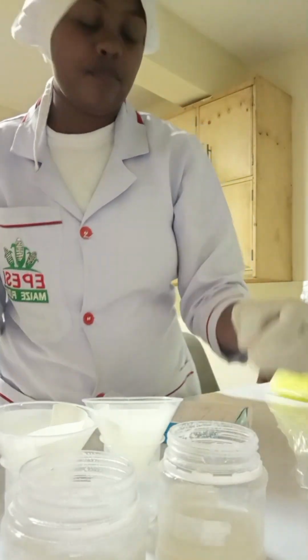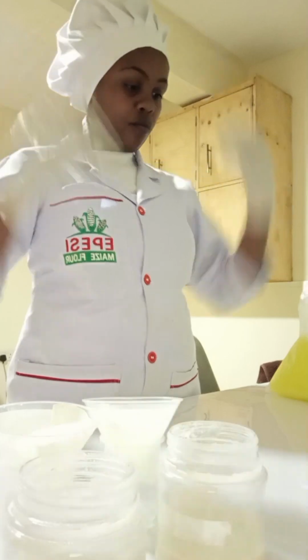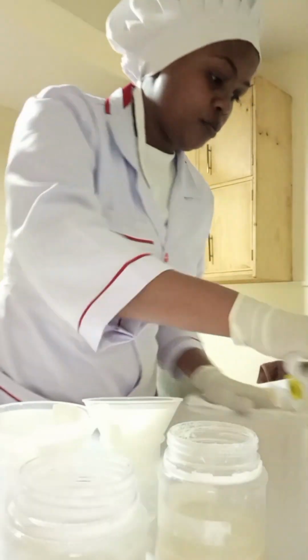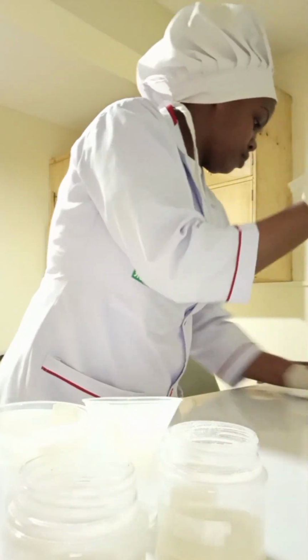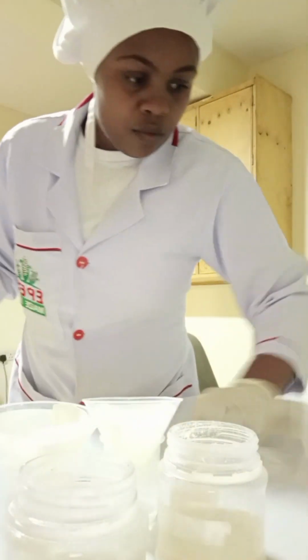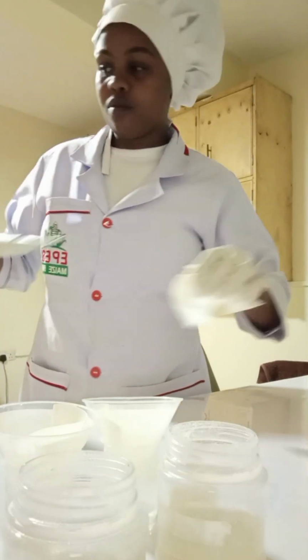You see I was confirming whether I had put it in the right place. There are some stickers that I didn't show. So in this case jar A goes to plastic beaker A, B goes to B, and you keep in mind that A is for a certain customer and B is for another customer.